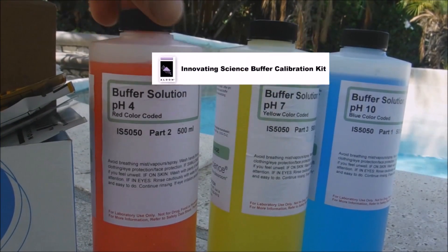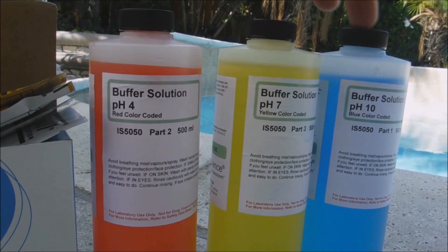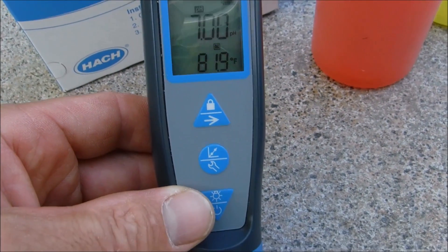You can invest in various pH buffers. You can also do a three-point calibration — pH 4, 7, and 10 — to give your pH meter the most accurate reading. By keeping the pH meter calibrated, you're going to get a really accurate pH reading.